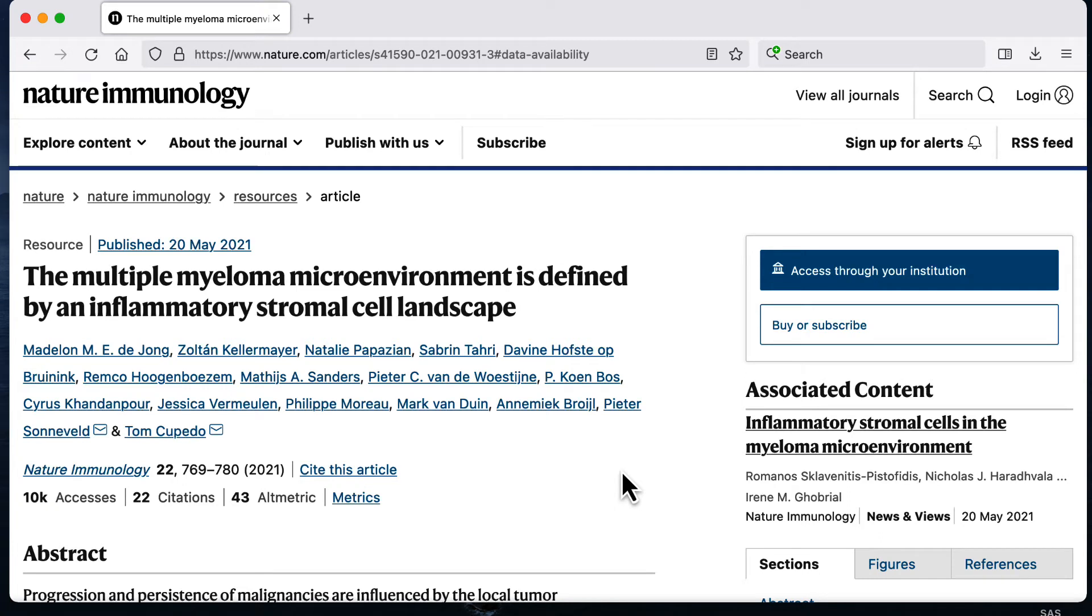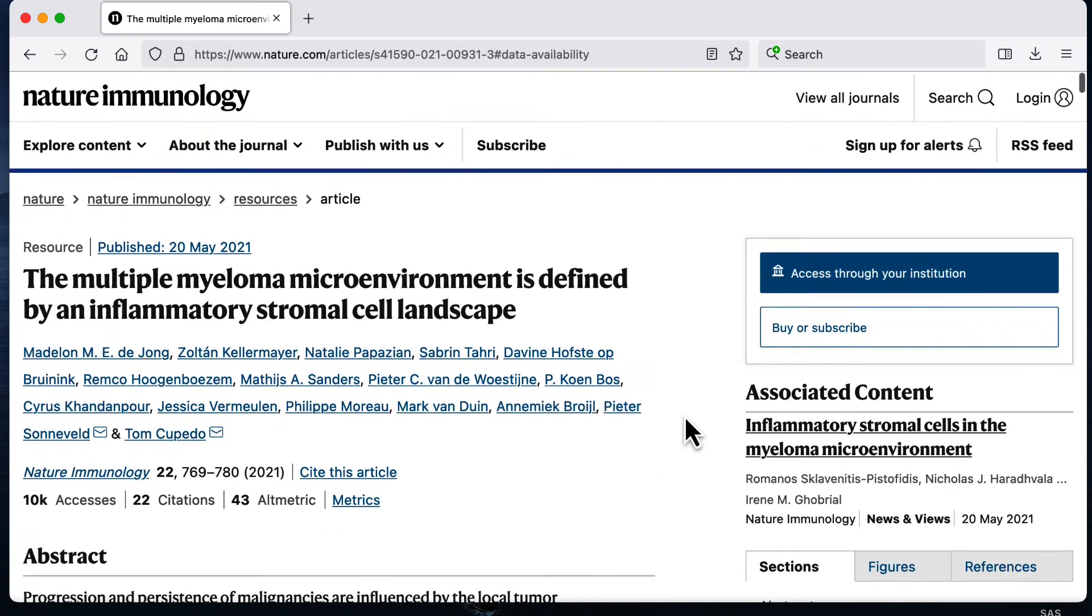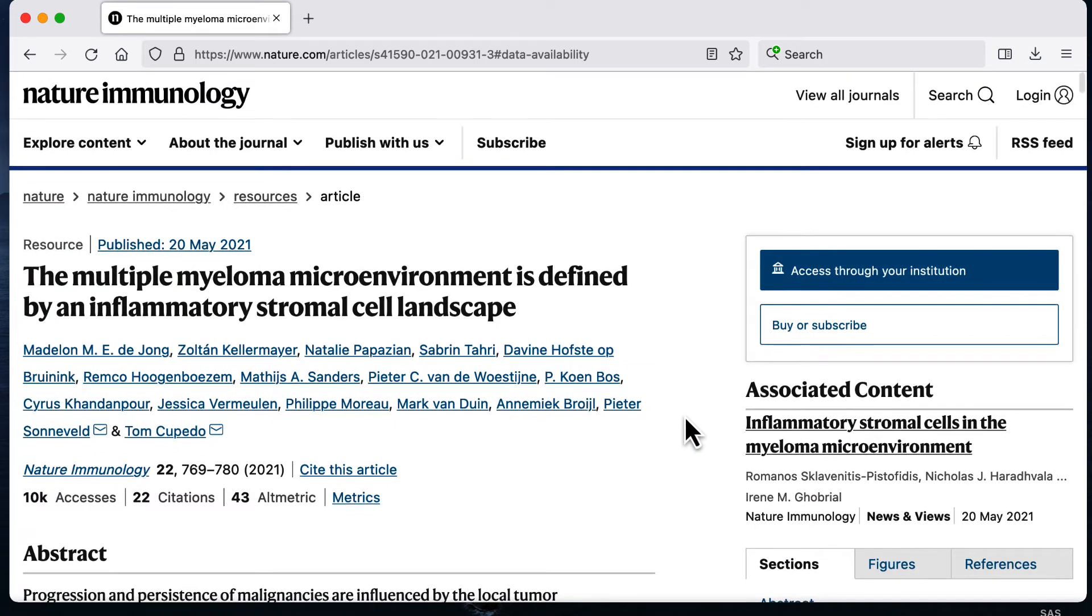Hey everyone! In this video I wanted to do a simple introduction on how to download bioinformatics data, and in particular I'm going to do an example for single cell RNA-seq data.